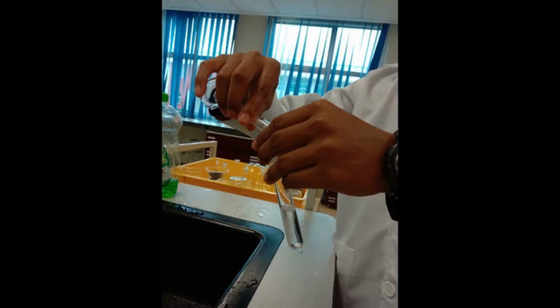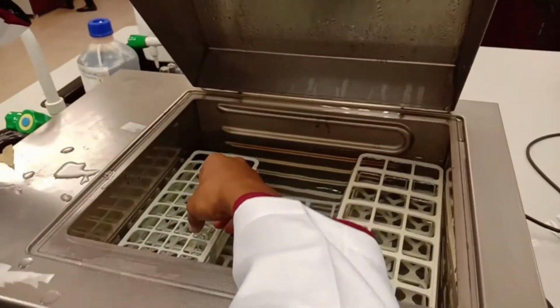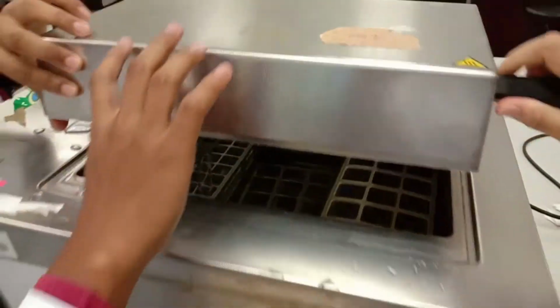For the stress activity, saliva from the mouth was collected after rinsing the mouth. 5 milliliters of 0.1 mg/ml starch and 1 milliliter of salivary amylase were added in a test tube. The mixture was incubated at 35 degrees Celsius for 10 minutes.